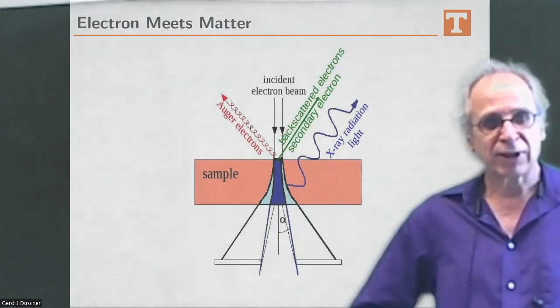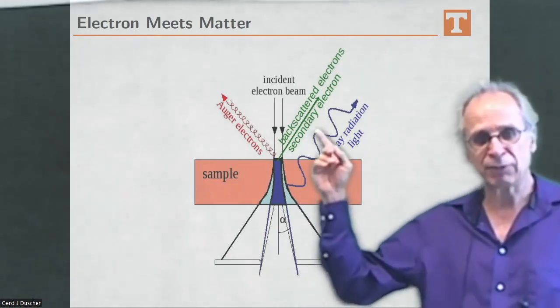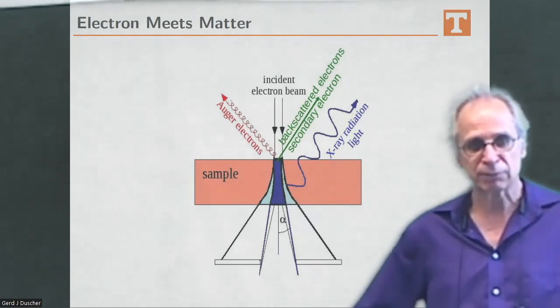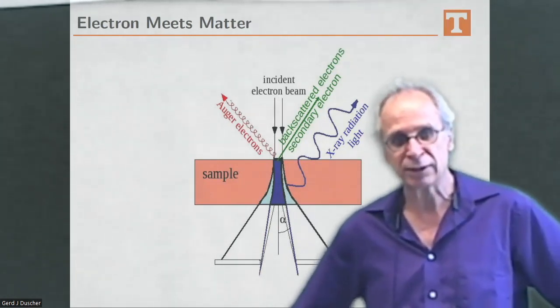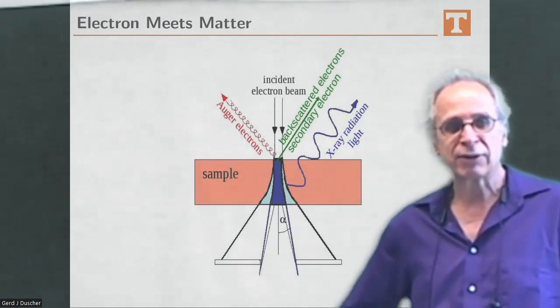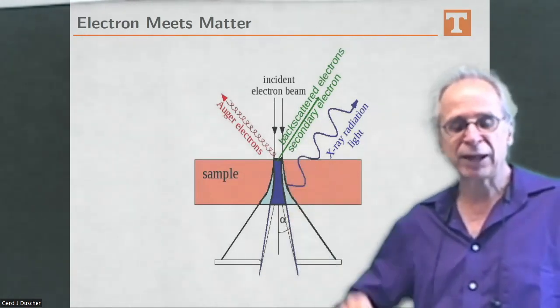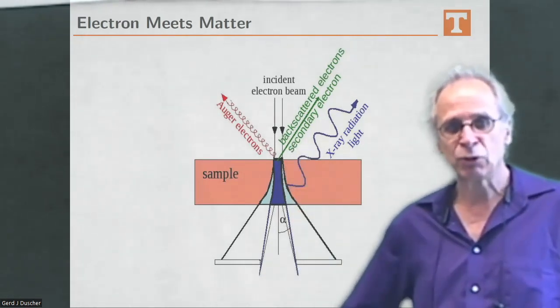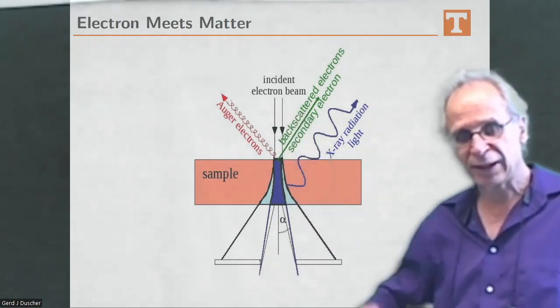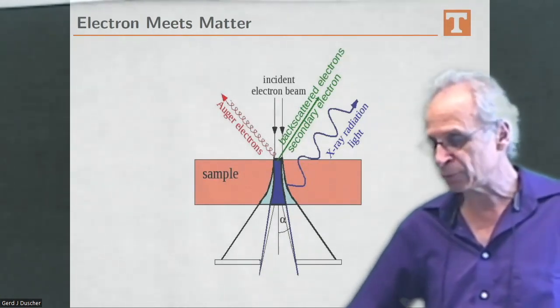There is something called channeling, and we will go into that when we do the simulation, I think in lecture 10, so the beginning of July. That is actually a dynamic effect, and it's due to the Bloch waves. So you select different Bloch waves, and then the electron can scatter more forward than you would expect.